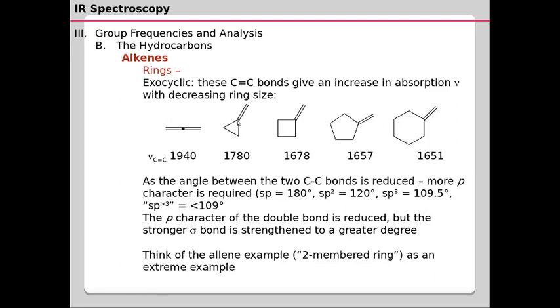Okay, so this will reduce the strength of the pi bond here, but for the sigma bond, what happens is, with the reduction in the 2p electron density, the apparent contribution of the 2s electron density on the sigma bond of the double bond system will increase. Okay, so the increase in the 2s electron character in the sigma bond will greatly enhance the force constant of the sigma bond involved in the carbon-carbon double bond system here.